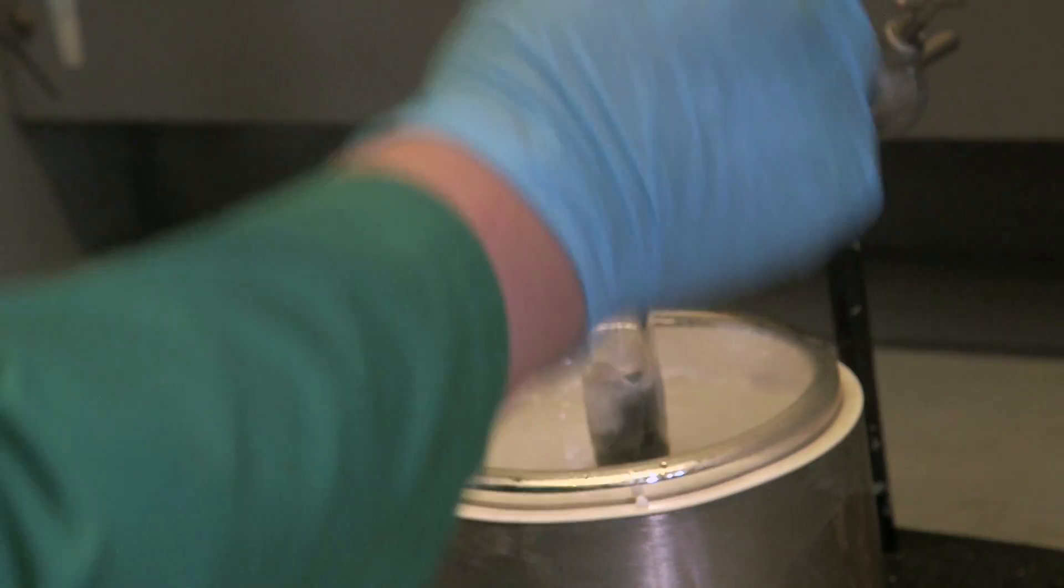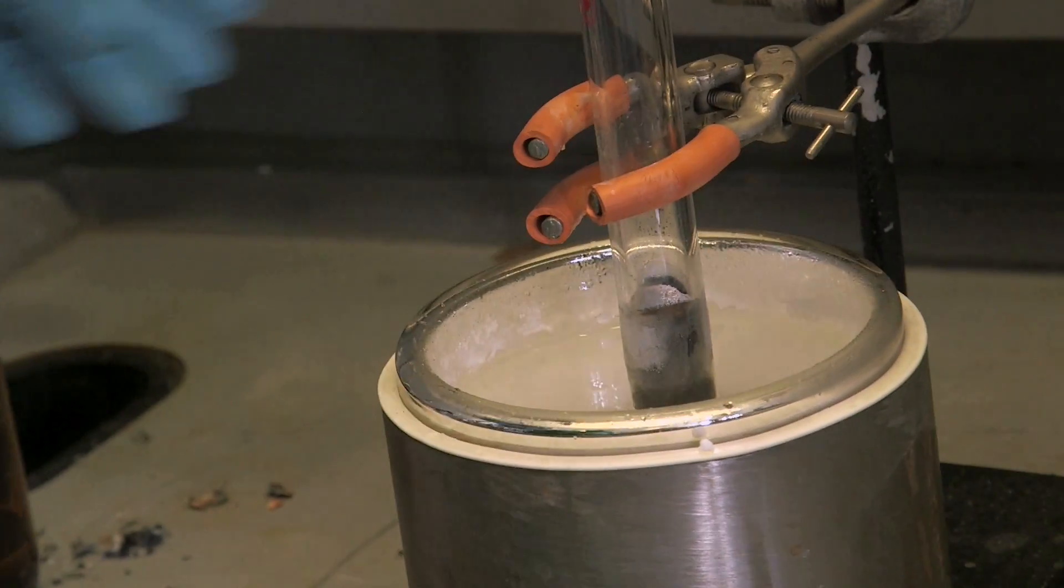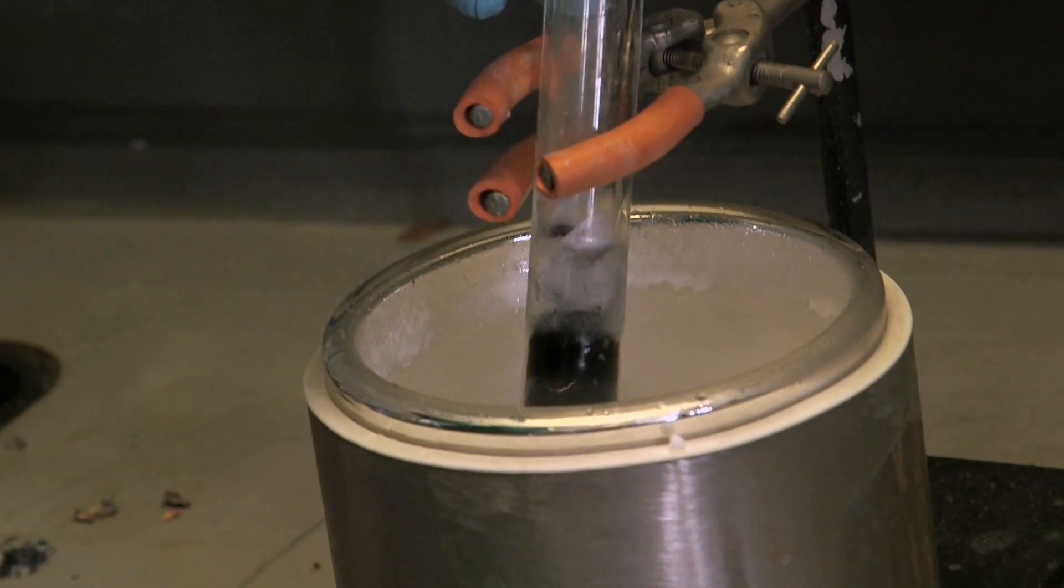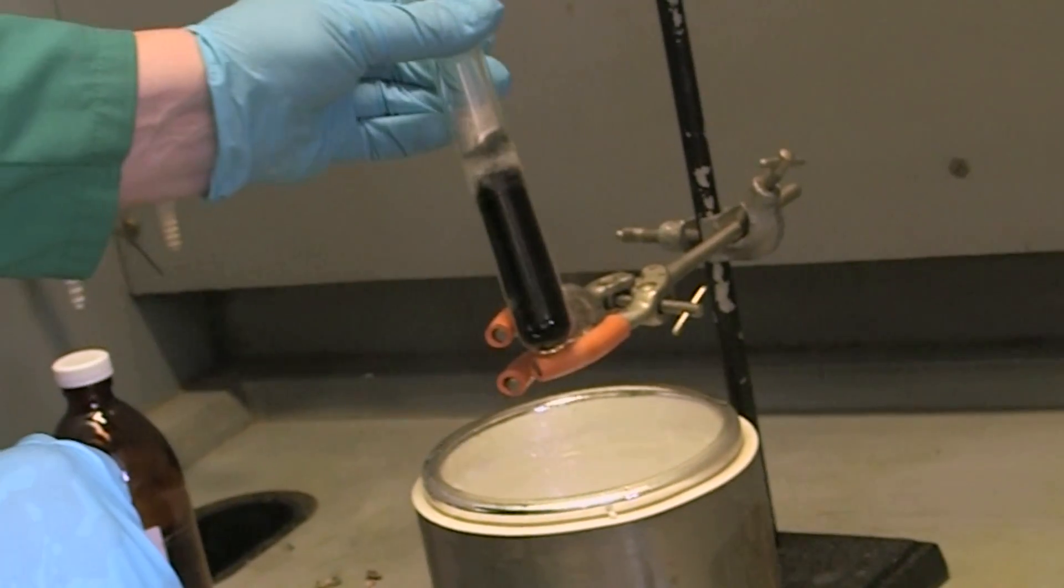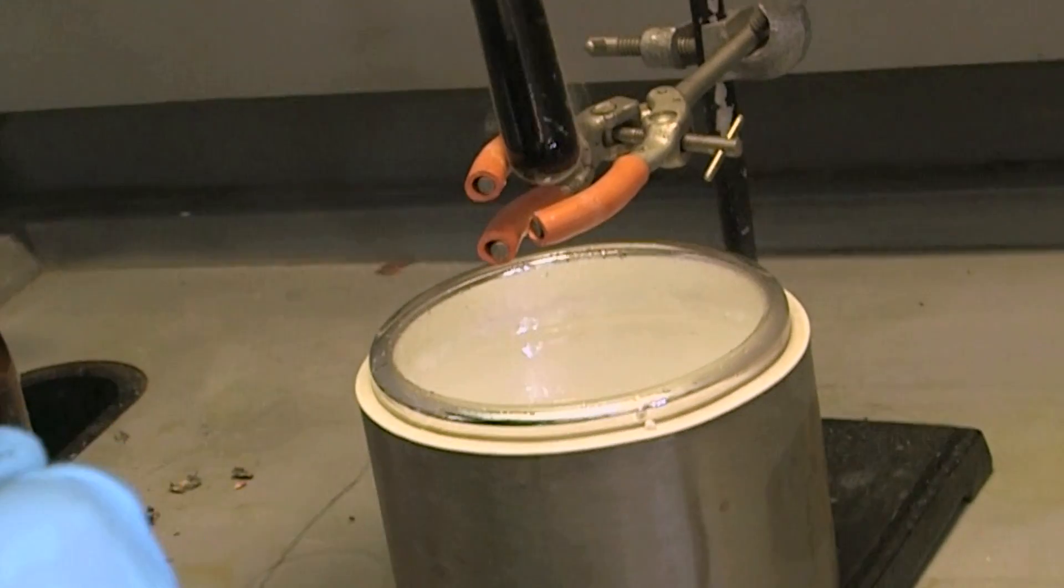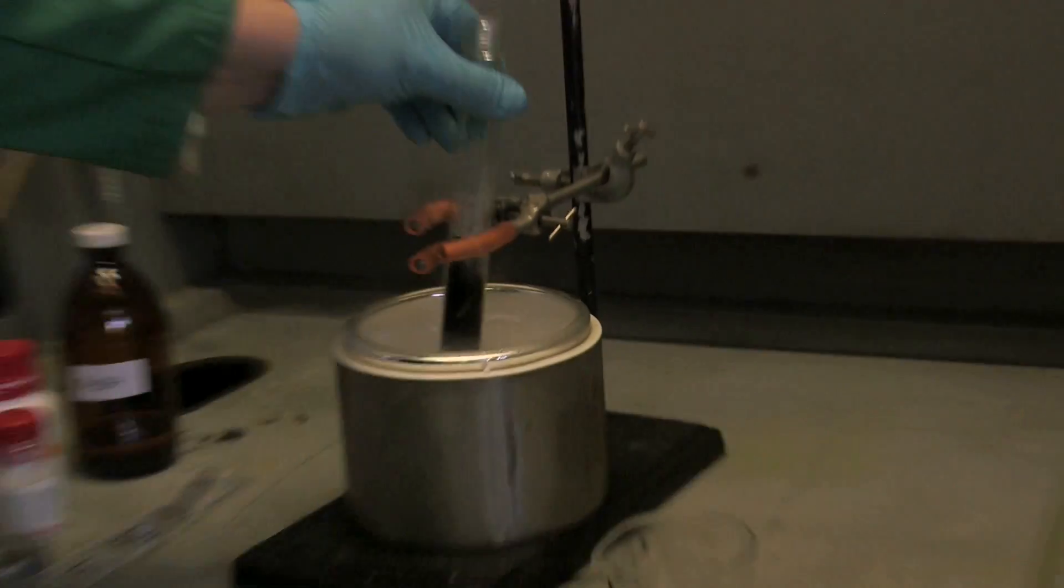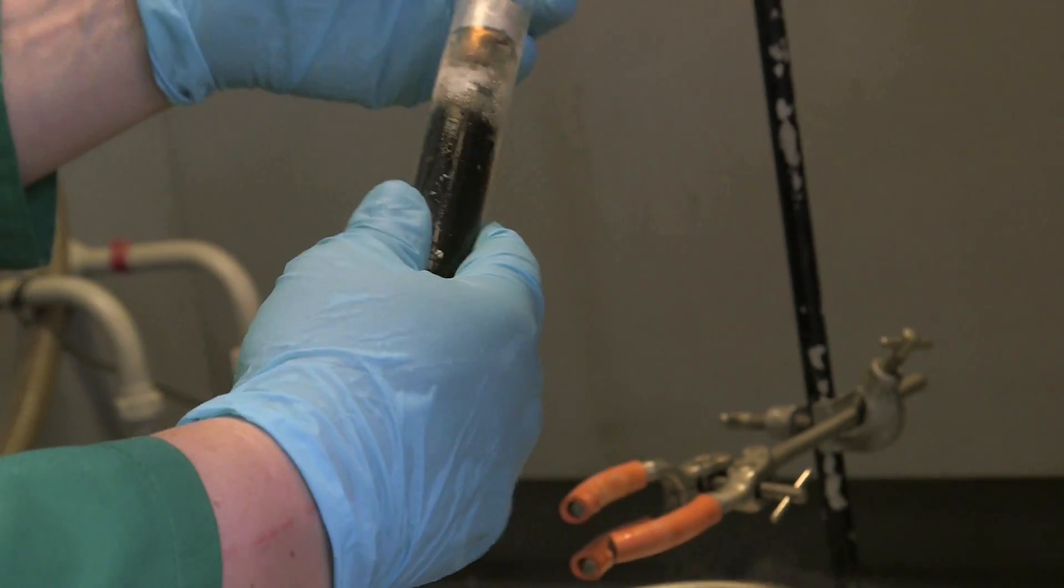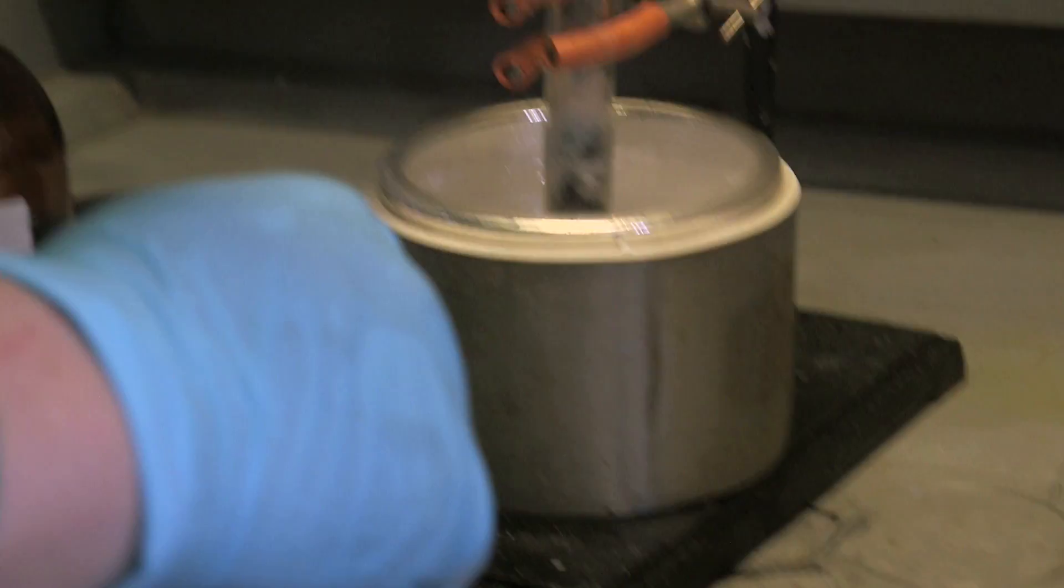Put some more sodium in there. And you can hear it fizzing as it reacts. So we've got a really, really intense blue color now. Almost looks black. So let's put that in there. I would have thought that would be enough, but you never know. See, we're already starting to see some of that bronze on the surface.